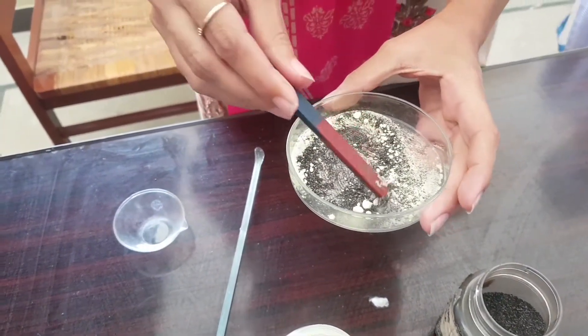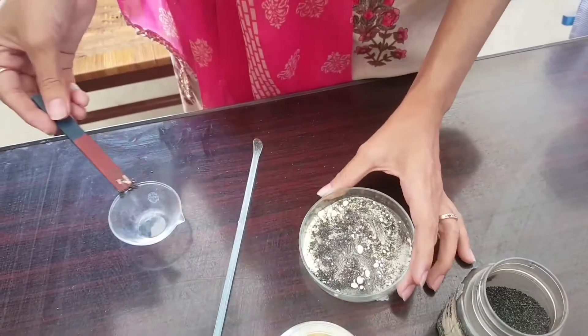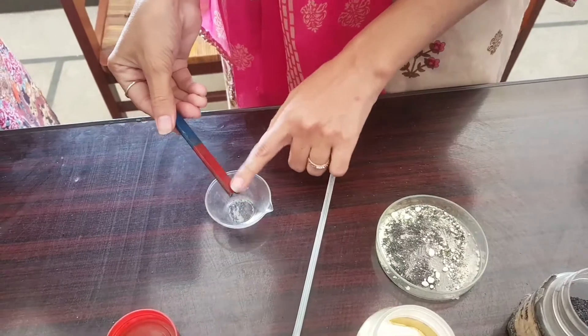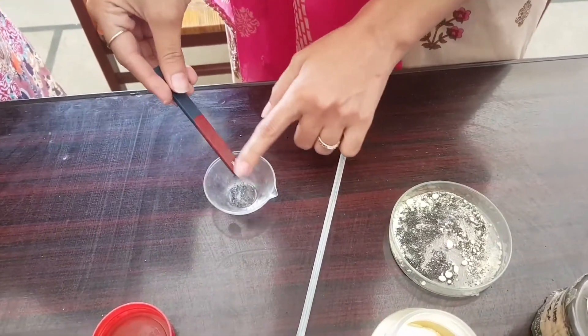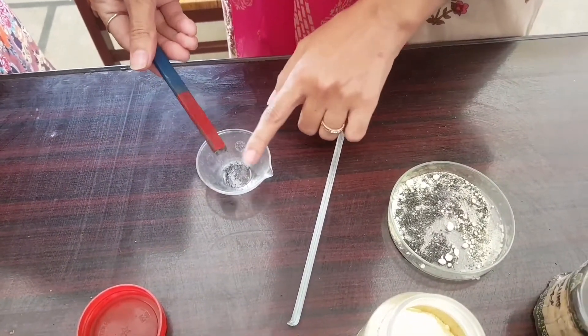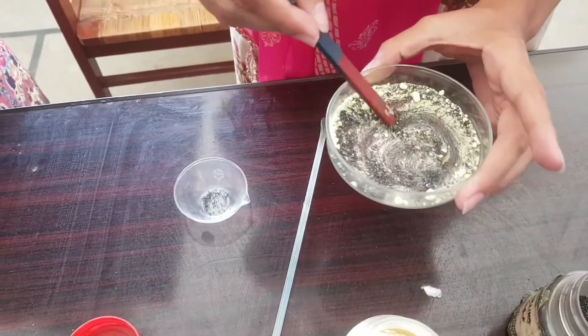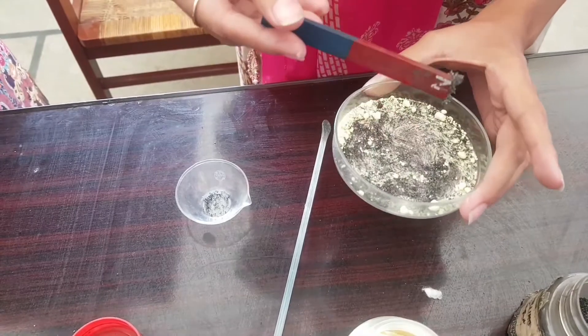I remove the iron fillings from the magnet with the help of my fingers into another watch glass. I repeat the process of moving the magnet into the mixture till no more iron fillings remain in the mixture.